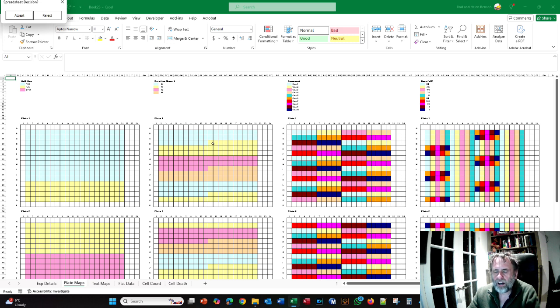So let's now add some space, so that rather than have the 24-hour stop at row 11, at least there's a space here before we start the 48 hours. So this will be the next exercise. So we're going to add some space in here.